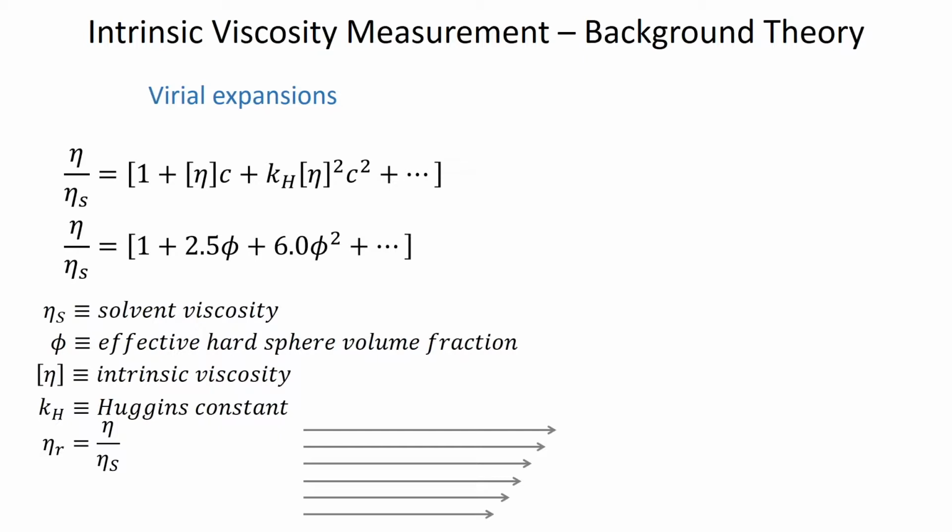The way to systematically add the complexity in mathematical form is to do what they refer to as a virial expansion. This is a common practice in statistical thermodynamics, where it's used for viscosity. It's also used for osmotic pressure, if you're familiar with this. But basically what we're doing is adding higher and higher order terms, which is going to introduce these complexities.